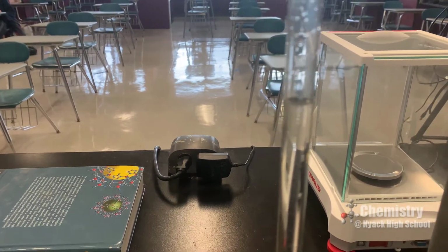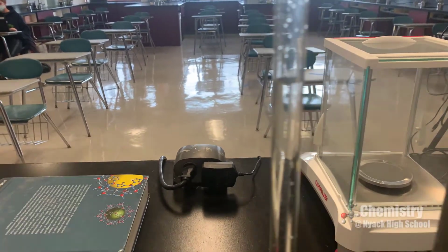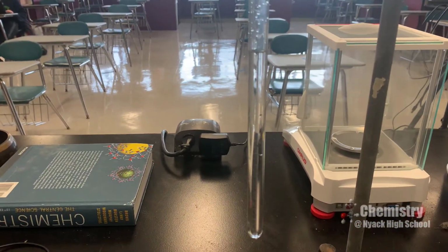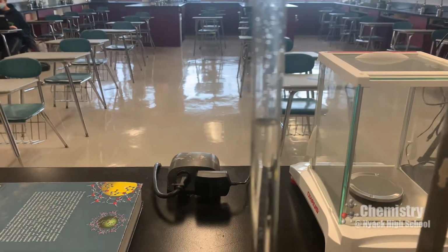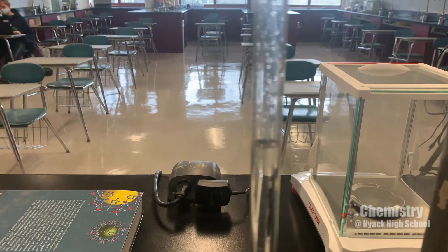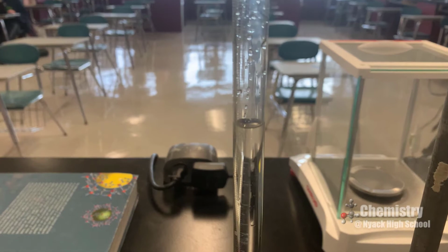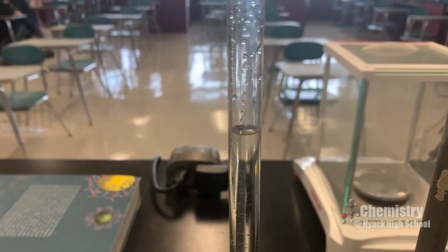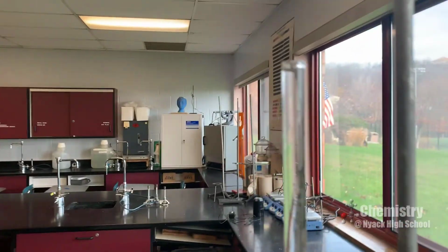Okay, so what I've done here is I've filled my eudiometer with about 15 milliliters of 3 molar hydrochloric acid. I'm going to add distilled water to the top of this in such a way to avoid mixing the water with the hydrochloric acid.